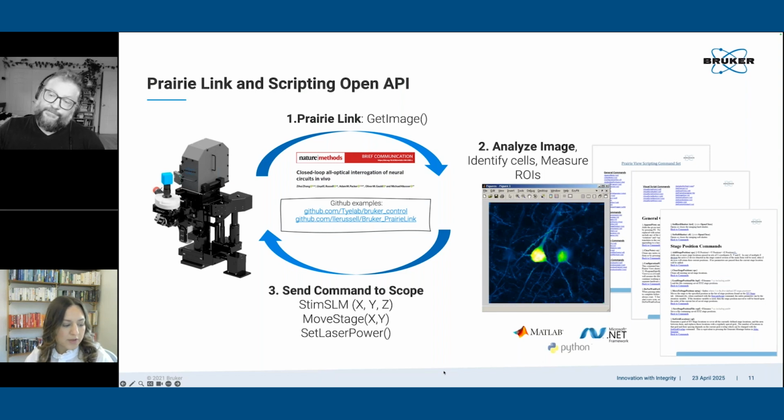So you mentioned being able to define an ROI and set some threshold. Can you define a complex ROI with the PrairieLink system you're describing? So could you have individual somas, neurons, regions of interest set as your threshold? Or could you set a threshold of, here's 10 neurons, I want 5 of them to reach my threshold, and there's my trigger? What kind of complexity can you introduce here?